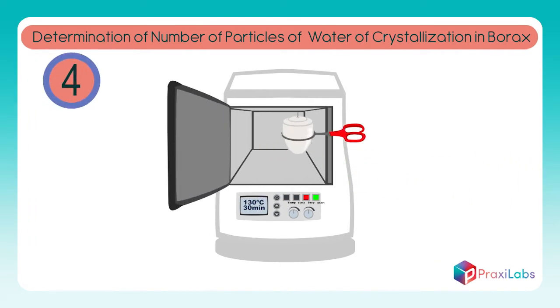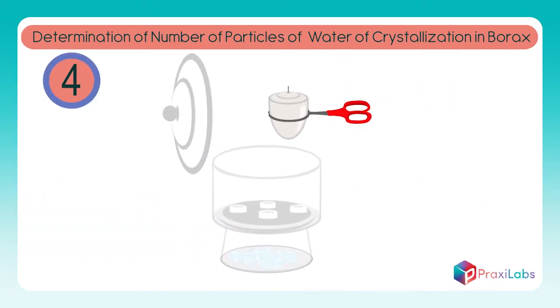Move the crucible from the oven to the desiccator using the crucible holder for cooling.